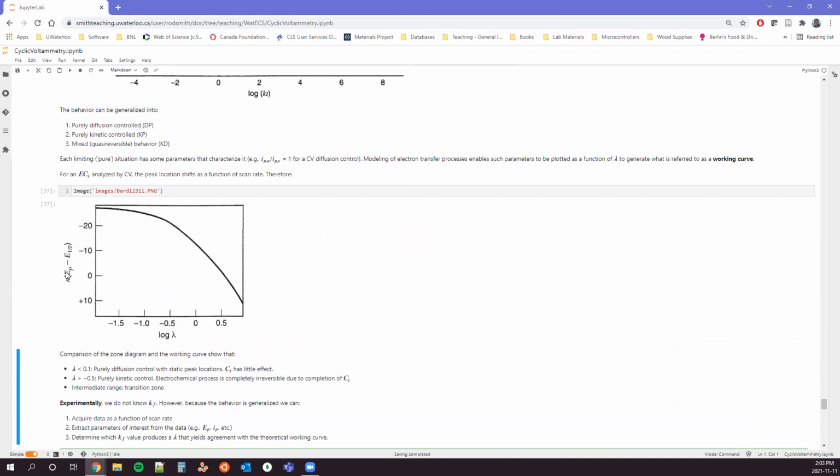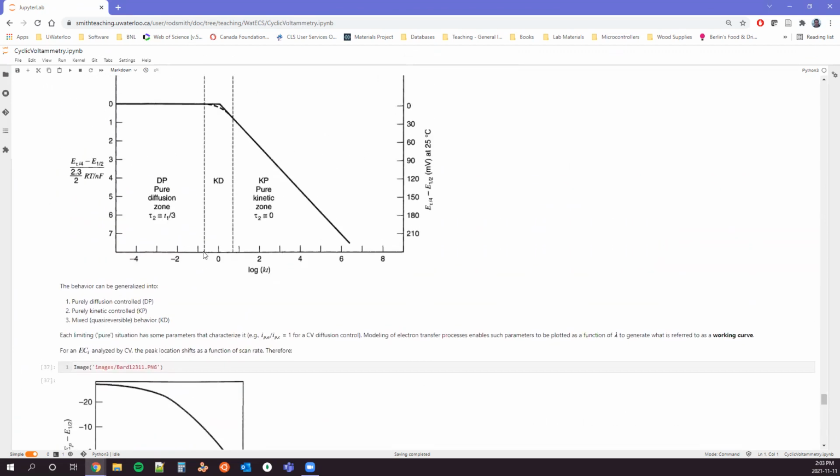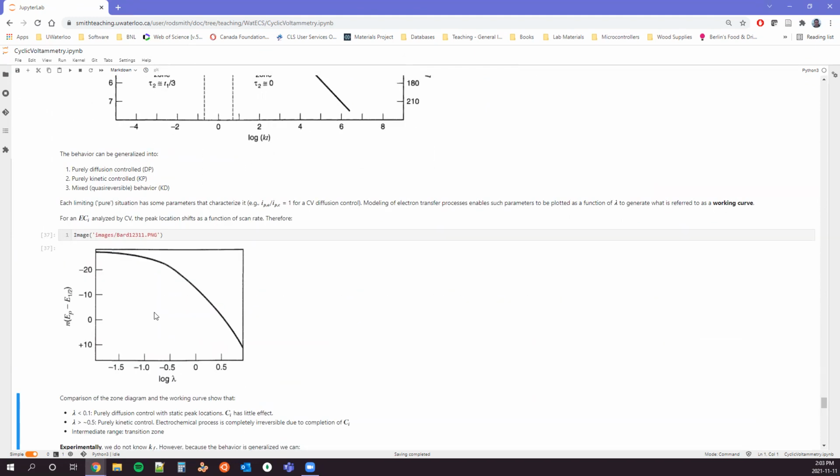And so we saw above what we expect is the shape of the wave. And so Ep minus E one half, how wide is that wave? We can plot that as our thermodynamic value. And so this working curve shows us the same thing that we have, again, with these same values at approximately 10 to the minus one here. We're looking at purely diffusion based. And when we approach 1.0 or 10, we're looking at pure kinetic. And so we see that here, right? And so we have our limiting behavior here for a reversible system, which we expect up above.